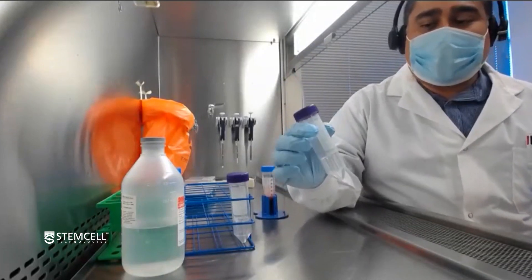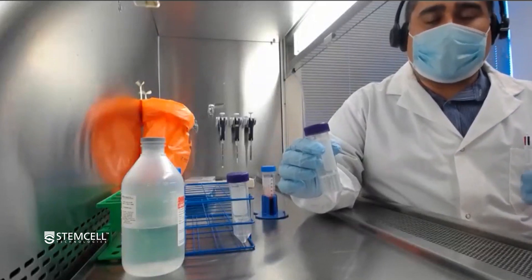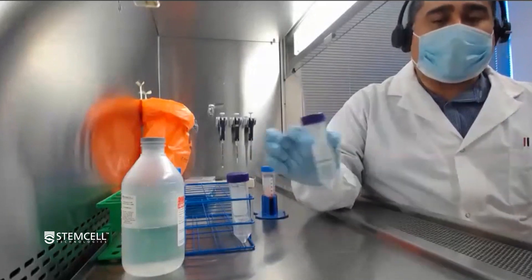To be clear, it's not going to increase the efficiency of removing the RBCs or the granulocytes from whole blood. However, it will make it faster and easier, which can help reduce the variability between technicians.